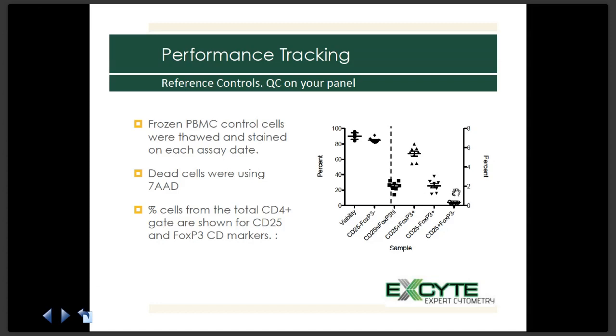In a case like, for example, this little plot, where it was not, then we would immediately start to do some interventions, start to try to troubleshoot what might be causing that problem. This benefits you, the researcher, by giving you an additional level of confidence without having to learn a whole new protocol and then track somebody down for the beads and run all that. You can use and track this.